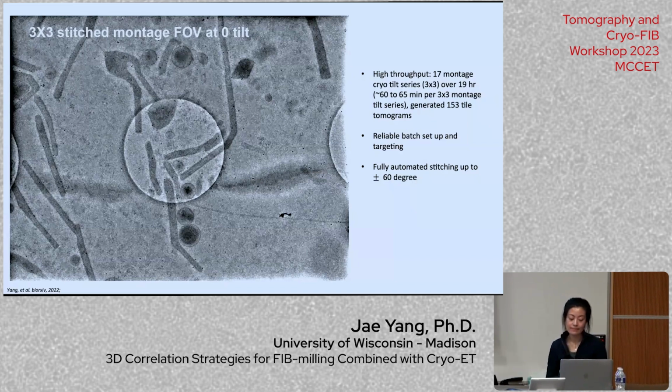There's a couple of online questions. I'll start with the first one, which is about the IFLM usage. Is the fluorescence imaging done automatically, kind of in an atlas-like procedure, or as a user, do you have to navigate and collect images at all positions? And how does focusing work with IFLM?